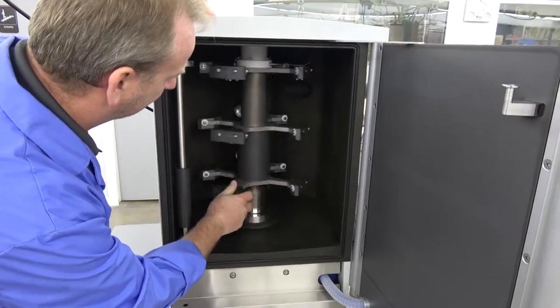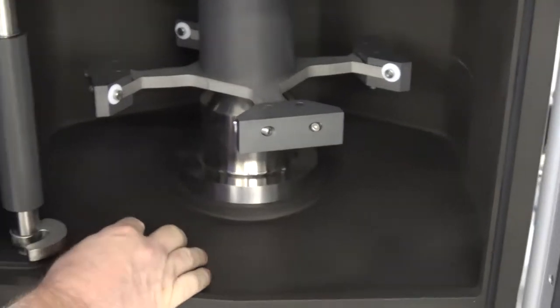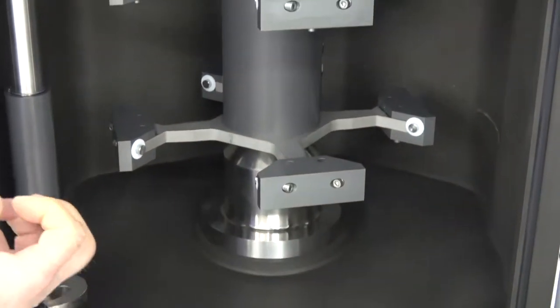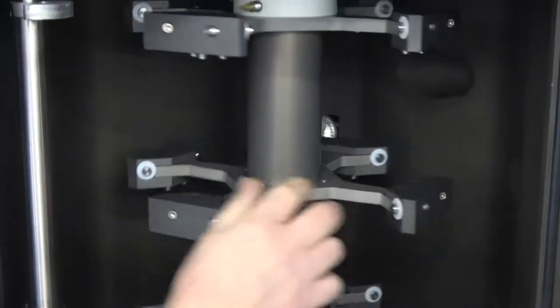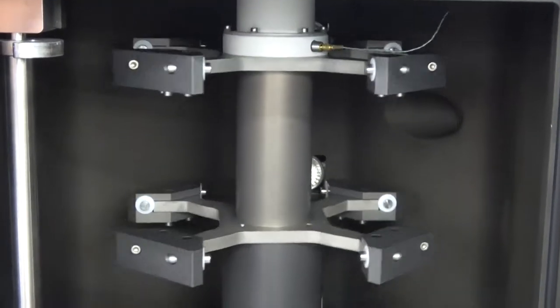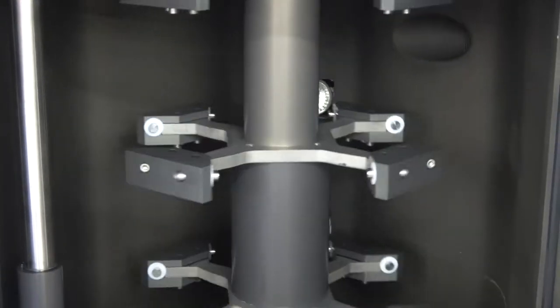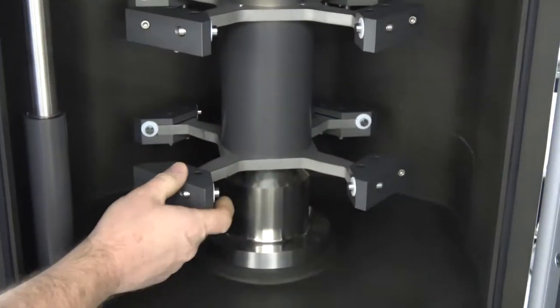Normally in the past you would see kind of like scaling on the walls and just from everything evaporating and it kind of absorbs into the walls and it gets all over the rotor here. But I did not see anything. We didn't have to do anything as far as scrubbing anything out of here. It was just immaculate.